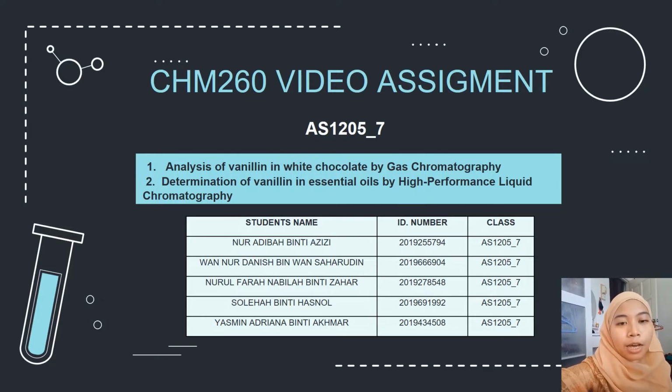Here is the list of our group members and we are going to present our case study on first, the analysis of vanillin in white chocolate by gas chromatography, and second, the determination of vanillin in essential oils by high performance liquid chromatography, HPLC.